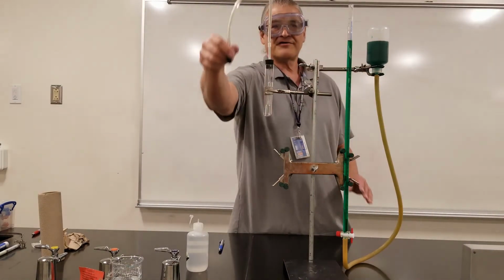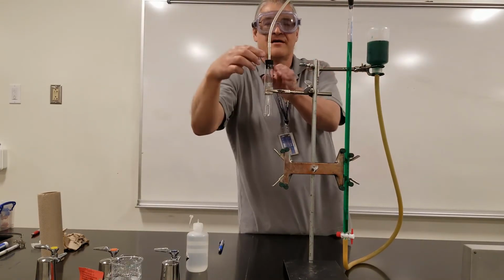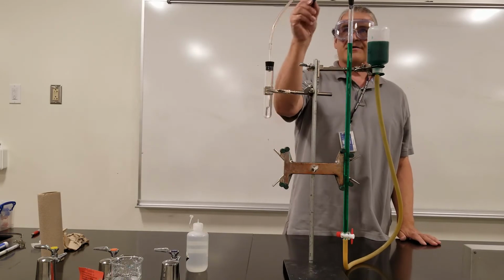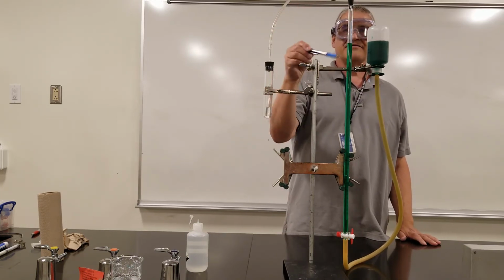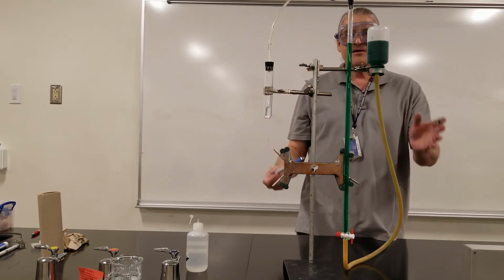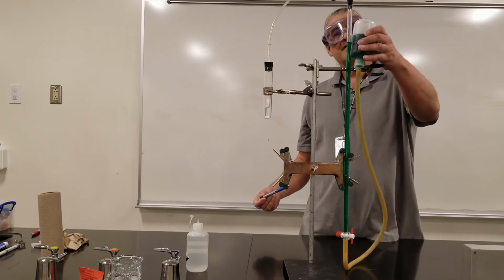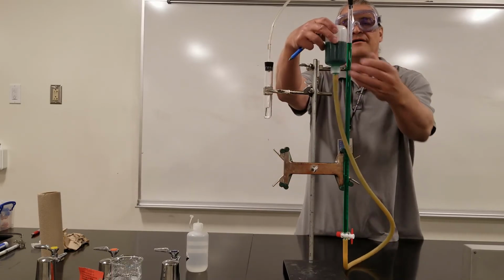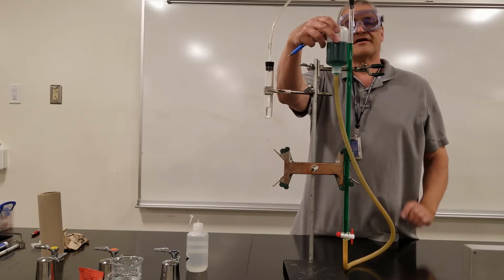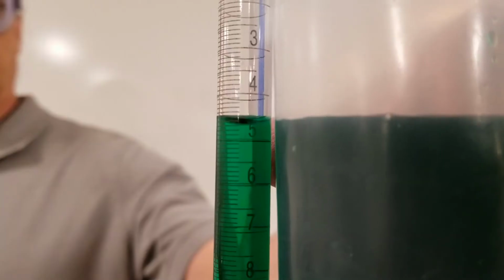Now, as soon as I put this stopper in, the pressure here is different than the pressure here, so the two water levels are probably off a little bit. Before you take a reading, you simply adjust it so the two levels are the same. This would be our initial volume in the burette right here.